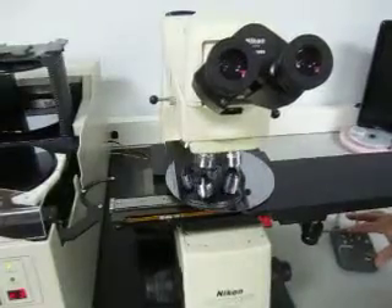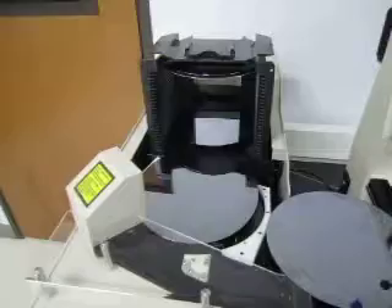We'll give you a look through the optics in a minute. Once the wafer is done being inspected, it returns to the position.